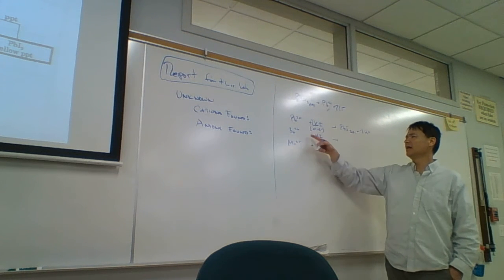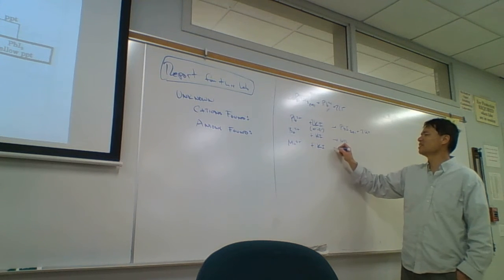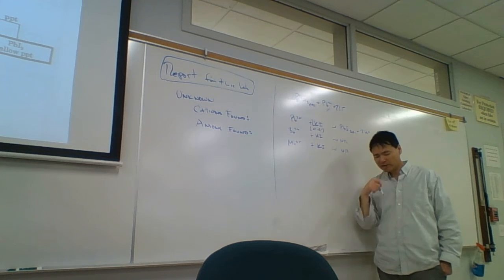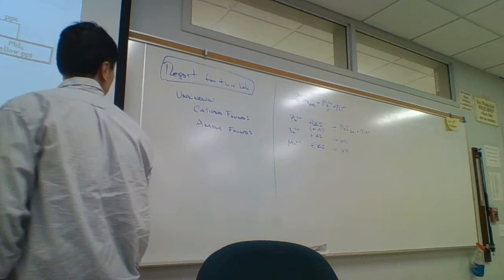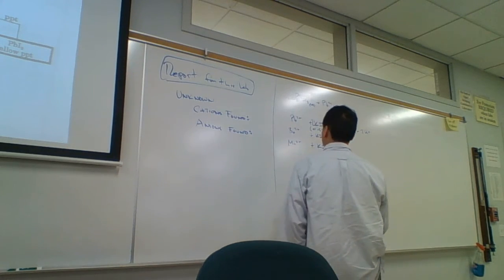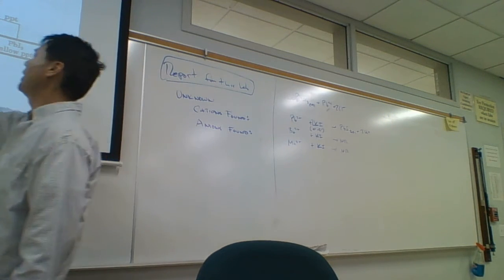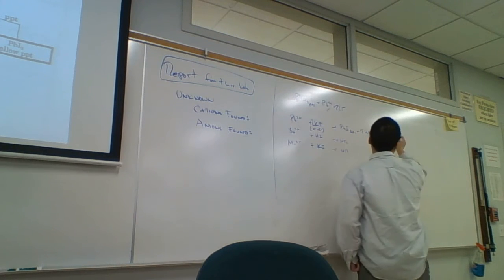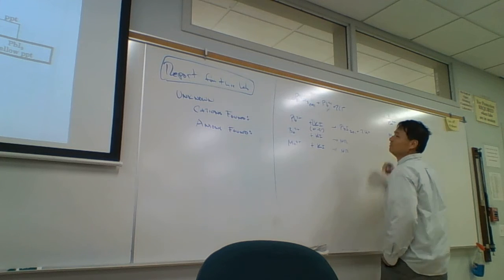Okay, barium iodide doesn't precipitate. And so what we end up here with is no reaction, and manganese iodide doesn't either. Iodides are all soluble except for silver, lead, and mercury. And therefore there's no reaction for those. Okay, then we're going to move on here with just barium and manganese. So we're going to separate out the lead, and we're left with barium ions and manganese ions here.